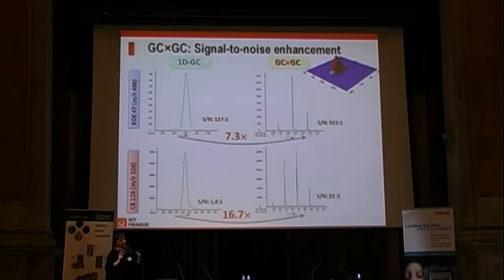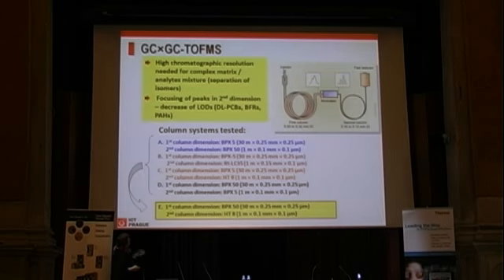Okay, but again, reminding you, our set of analytes was a lot of different compounds, brominated compounds, chlorinated PAHs. So we had to go through testing a lot of column combinations, and at the end we found the best one, because the critical parameter is coelution of some compounds which cannot be spectrally resolved. And this is just an example of the outcome and what you would expect. You have such a type of chromatogram with PCBs, PBDEs, and PAHs at the end. And this is a real life sample, for example, from the Elbe River.